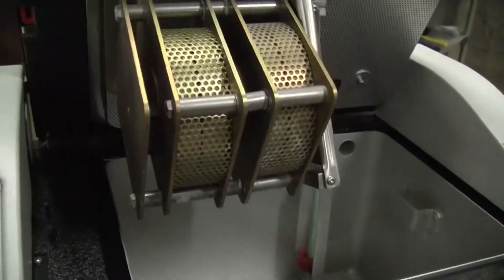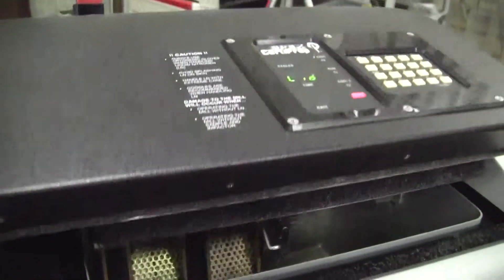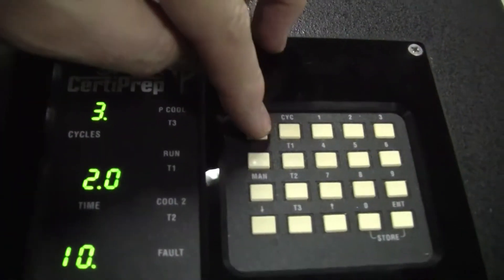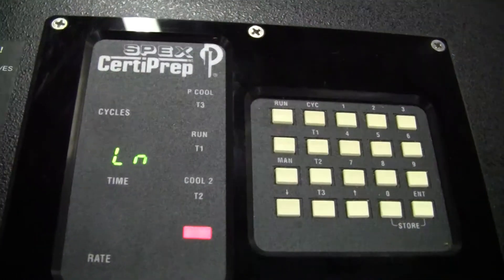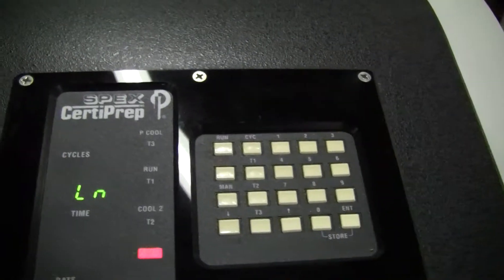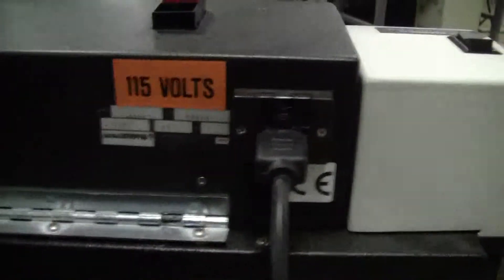Let's close it out. We can't run it because we don't have liquid nitrogen. If we hit the run button, it'll give us an error message — that's 'no nitrogen'. Runs on 115 volts.